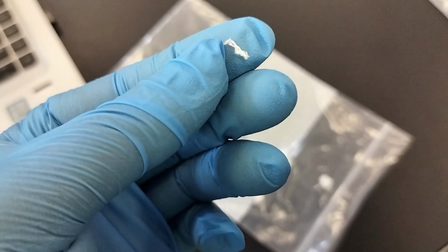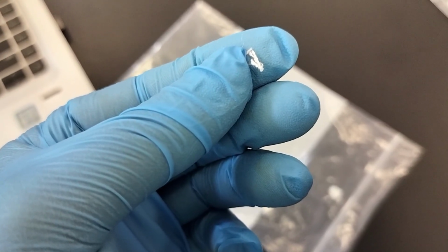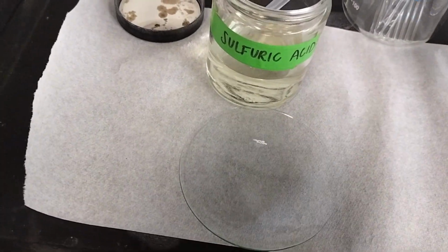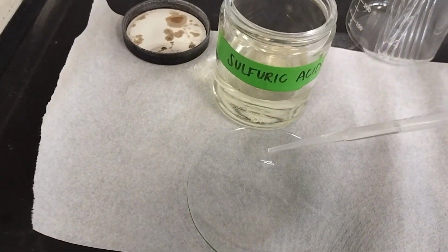So, this is a cotton fiber sample, and I'm now going to place it in the sulfuric acid and observe the reaction. Let's see what happens when the fiber comes into contact with the chemical.